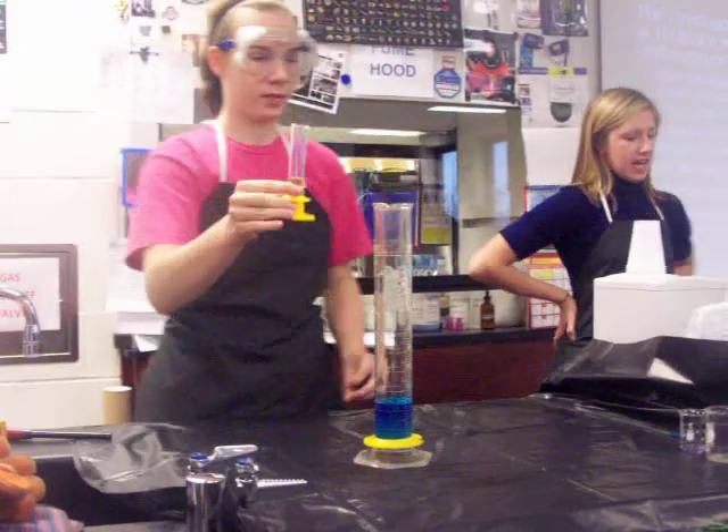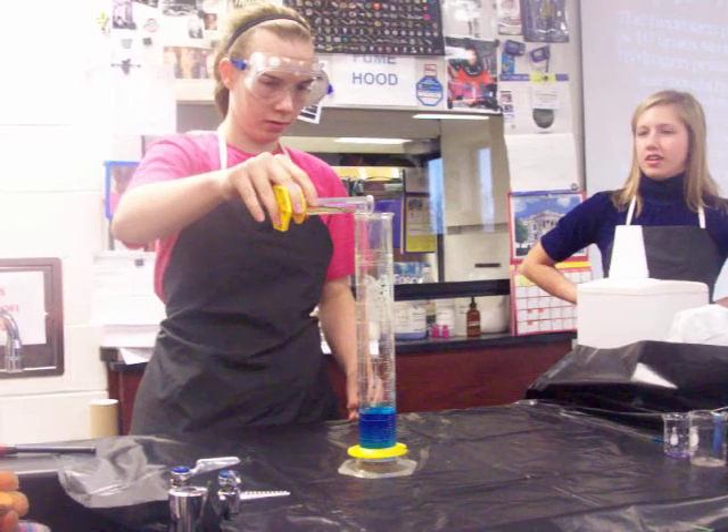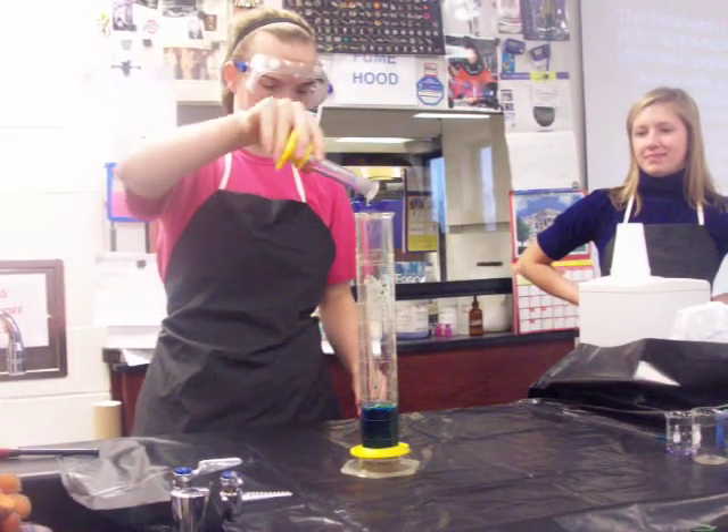Next she's pouring in the potassium iodide, which is our catalyst. This will cause the reaction to occur at a rapid pace.